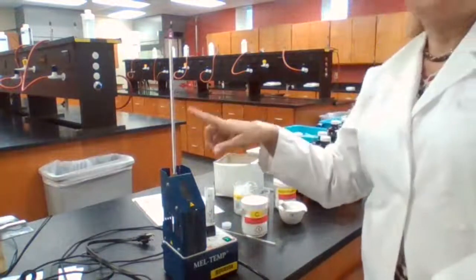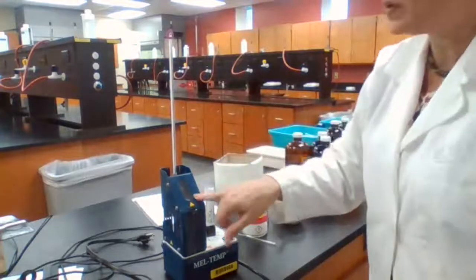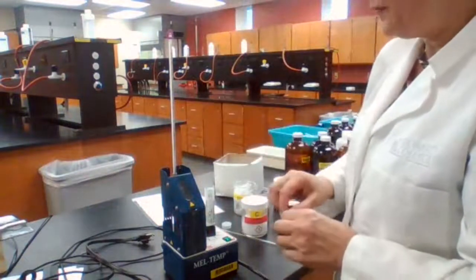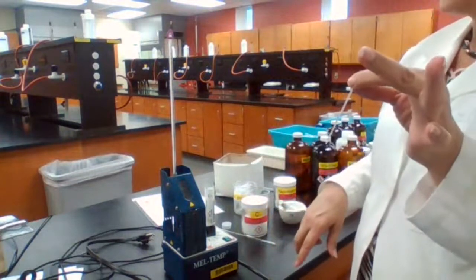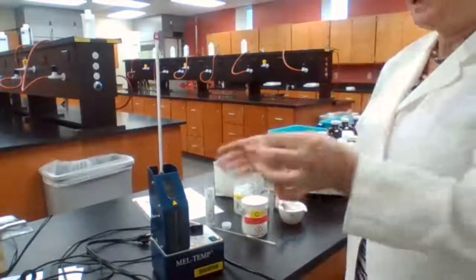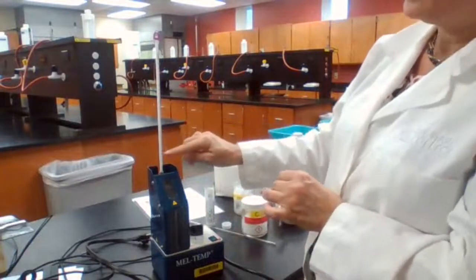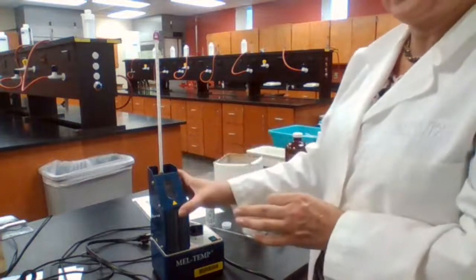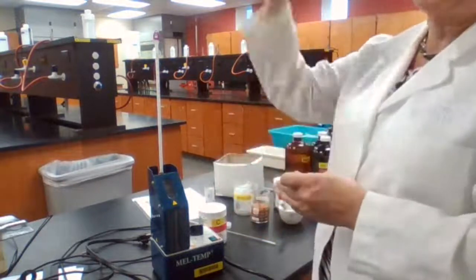The temperature on the thermometer should be less than the melting point of the sample. And in this case, my unknown melted right away. That means the melter apparatus is too hot for this unknown. I'm going to have to wait until the temperature drops, like by 10, 20 degrees Celsius, before I can use this. Unless I change my unknown and get a different unknown with a higher melting point.